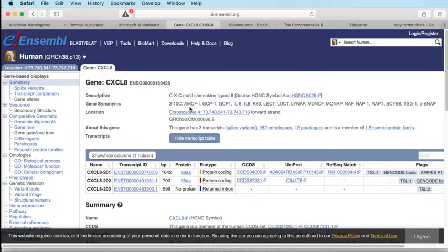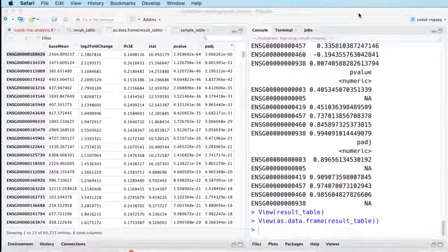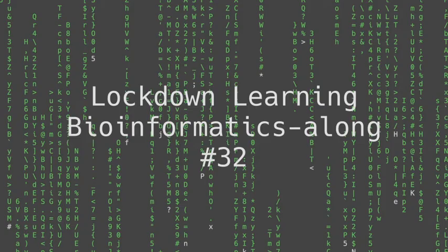And if you've got to the point of having differentially expressed genes, then hopefully you could reorder that data frame by the different columns and find the one with the largest regulation and other things as well. We're going to look at this in more detail next week. Okay, so I'm not going to completely spoiler myself by going into any more detail now.